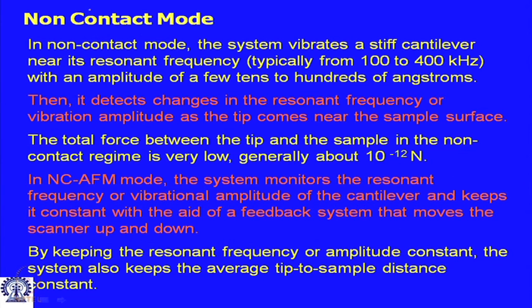So, the next mode that came into existence was the non-contact mode. I have pointed out that non-contact mode is rarely used, and you will soon realize why. It is rarely used for imaging purposes, but there are some special purpose imaging like electrical force microscopy or magnetic force microscopy to identify electrical or magnetic domains on the surface, where non-contact mode imaging is used. But it is often used in conjunction with something like contact mode imaging, and then by a subtractive mechanism you would like to dig out different domains. We will discuss some of these techniques probably in the next class. So, then you will have an idea.